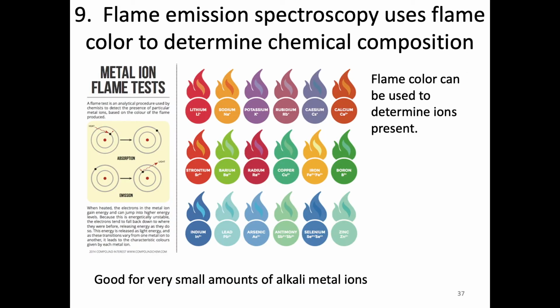Okay, so we've talked a lot about particle size and then just now surface area. We haven't really talked about any compositional techniques yet, other than EDS, something that you can use inside of an electron microscope. So I did want to look at some spectroscopy techniques that we can use. And the first one is flame emission spectroscopy.